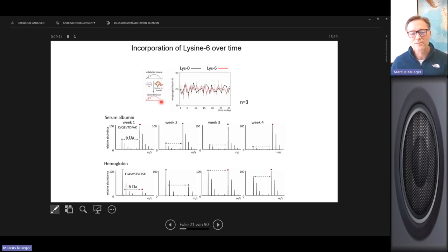And then we basically see the weight. This is what we did to control the weight, whether the diet somehow influences the mouse behavior. So there's no obvious behavior change, no weight loss, everything is the same compared to mice which are under regular diet. And we did it not only 3 times, but several times. And then, of course, what we did is the easiest thing, not to kill the mice. So we take some blood samples, right?